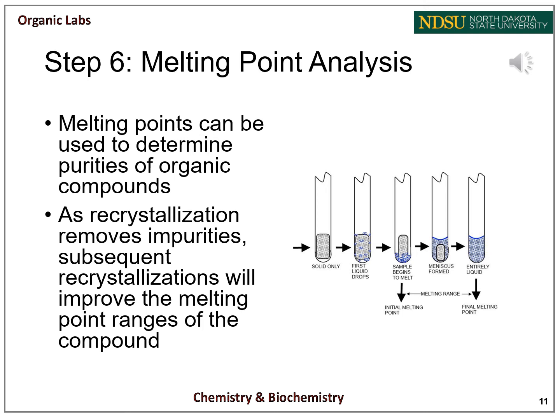If the values received are close to literature values, we can stop here and observe the crystal's appearance and get additional characterization data. Or if the values received are not close to literature values, subsequent recrystallizations can be done to further improve purity, as we'll see in the next slide.